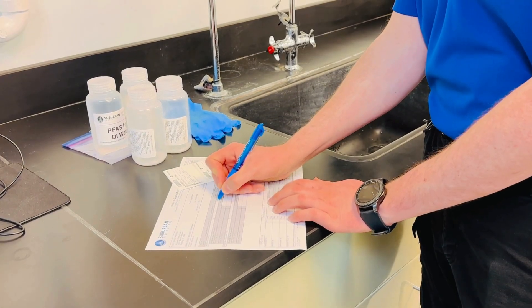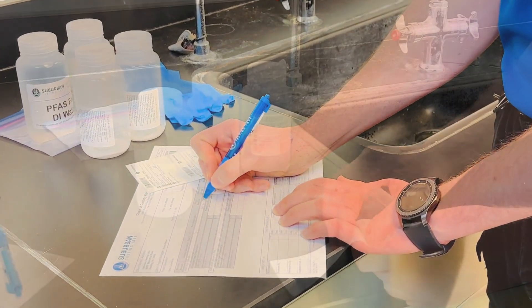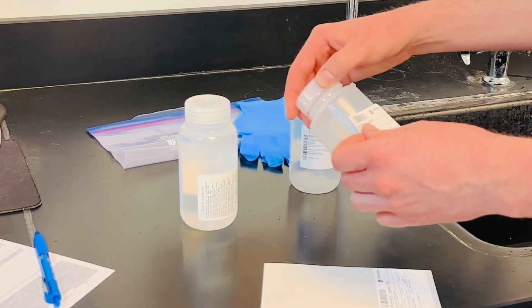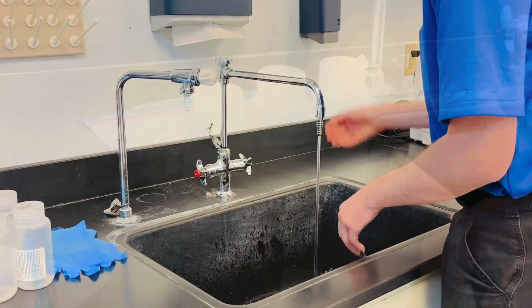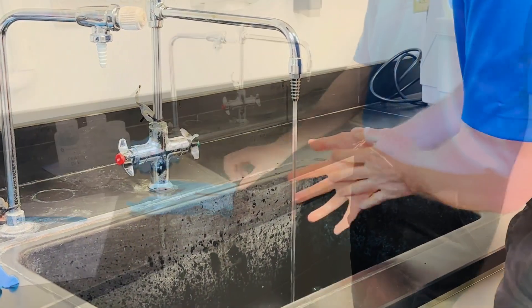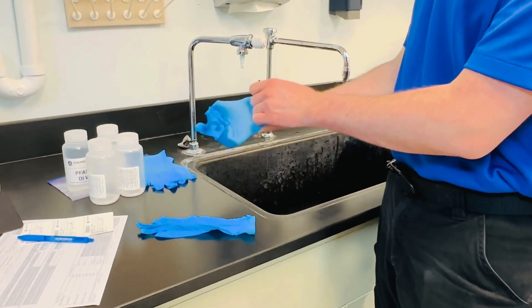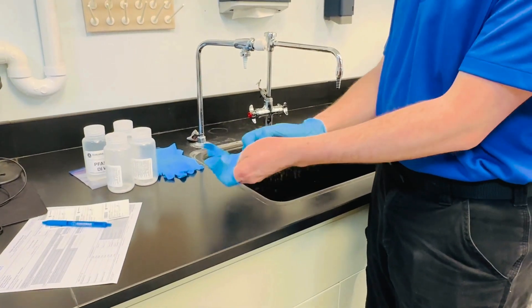Immediately before sampling, complete the sampling information on the labels and chain of custody form. It is essential that you pay very close attention when applying the labels. First, wash your hands well with PFAS-free soap. Then apply your clean nitrile gloves, ensuring that you are using new, unused gloves at each sampling event.